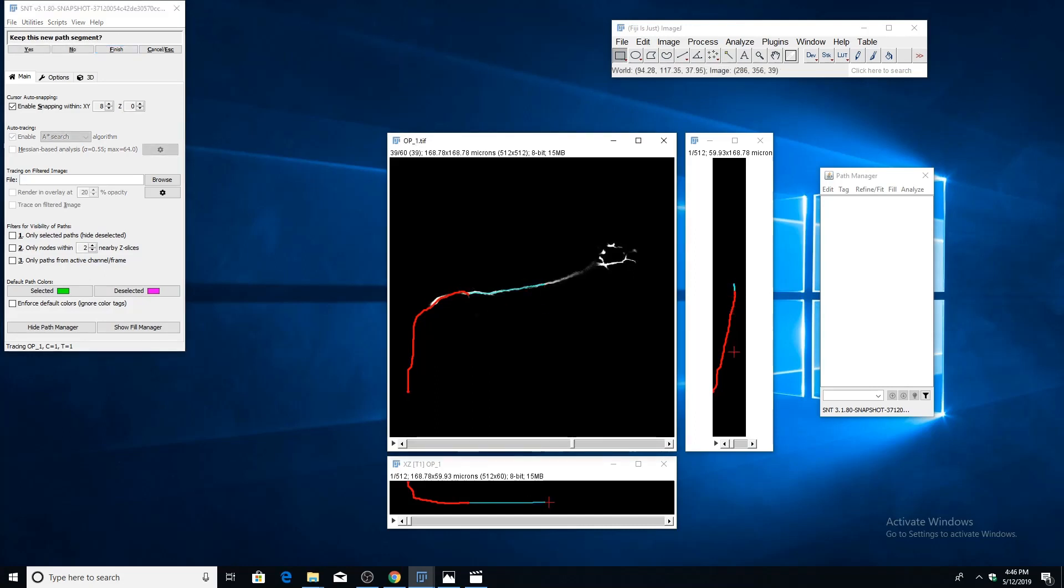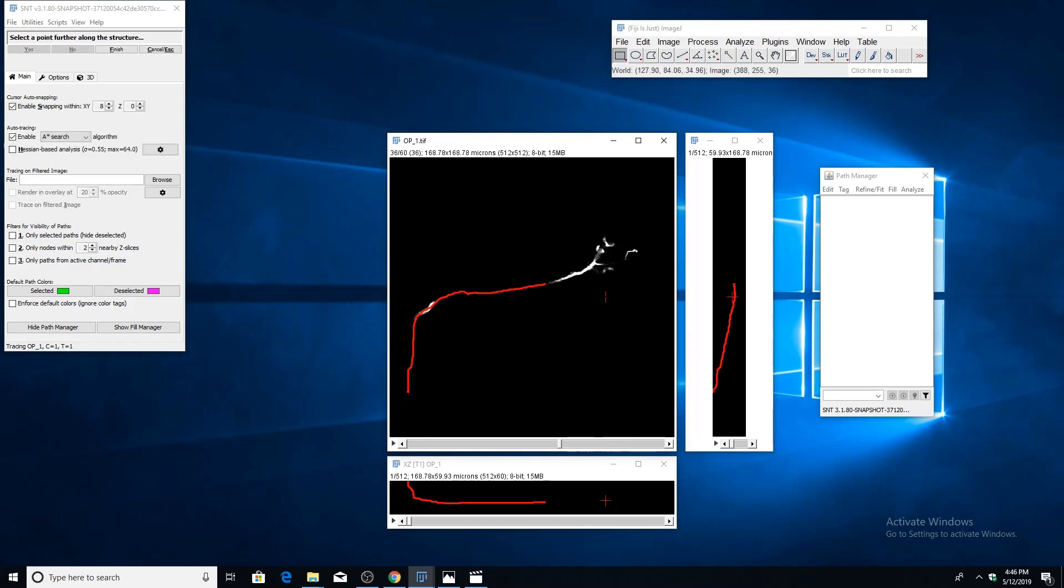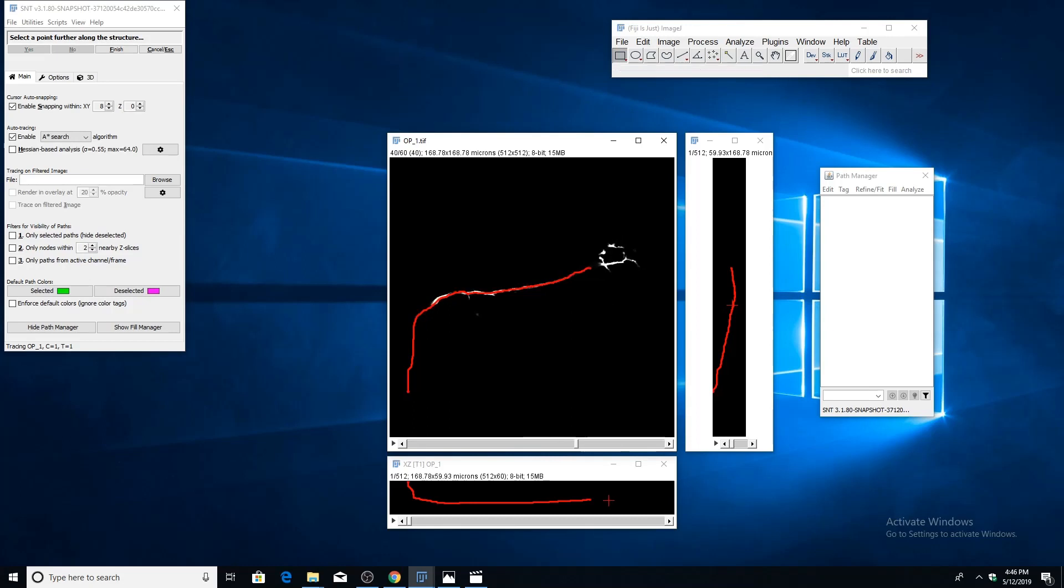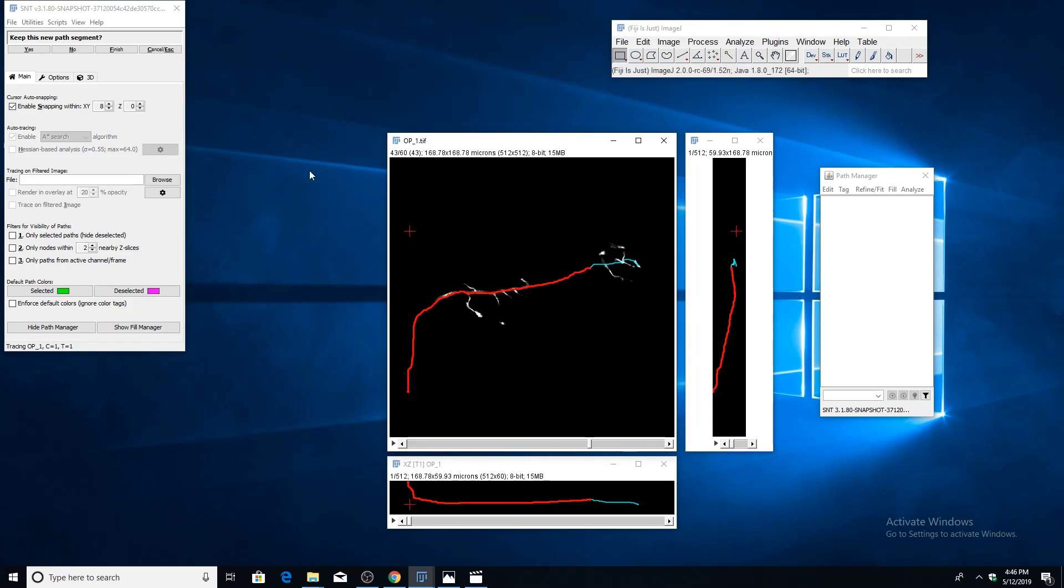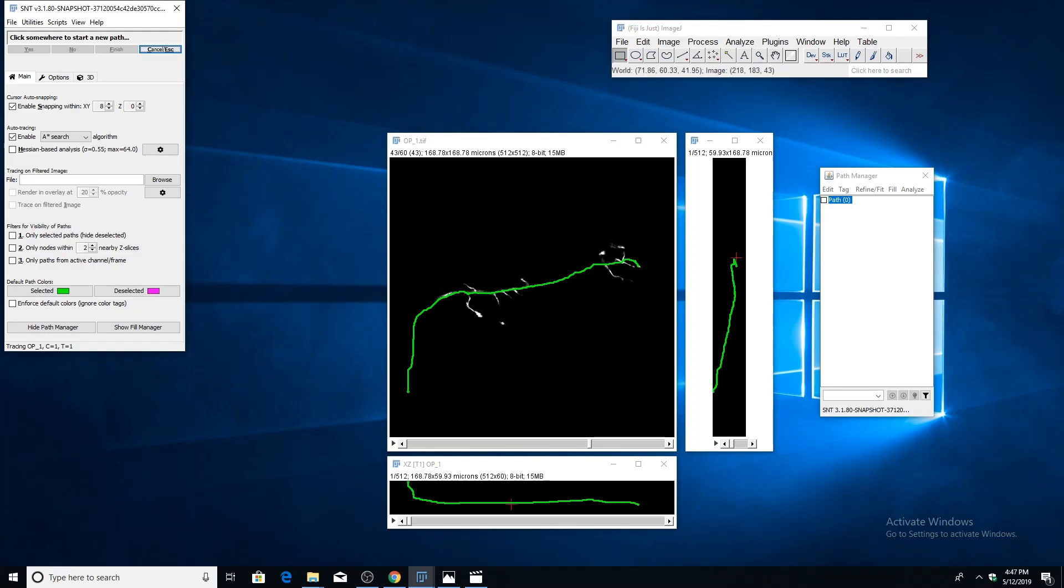Once you do reach an endpoint, you can finish the path by pressing F on the keyboard or finish up here, and it will add that path to the path manager and select it, turning it green.